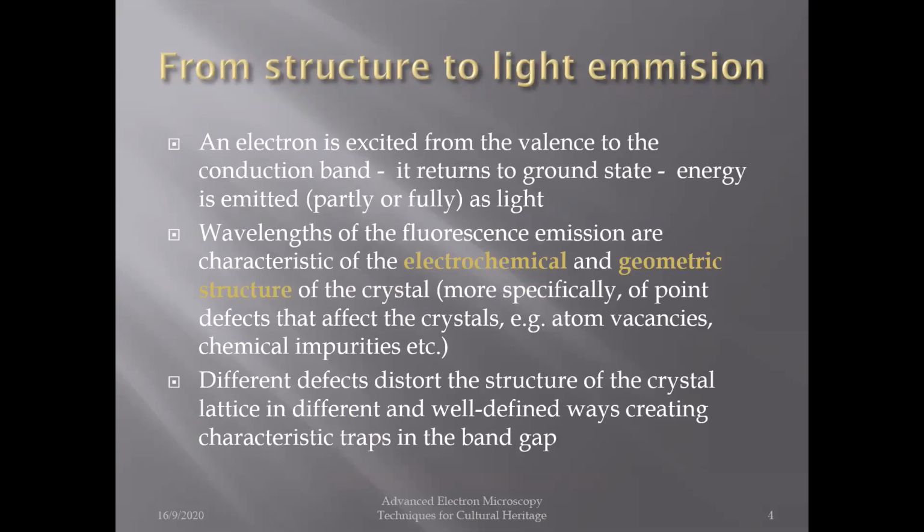So when an electron of our sample is excited, then as we know, it will return to its ground state, and then it will emit energy. Part of this energy will be emitted in the form of light. And the interesting thing is that the wavelengths of this fluorescence emission will be characteristic of the structure of the crystal.